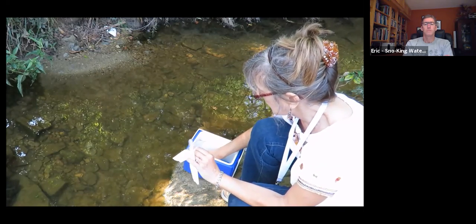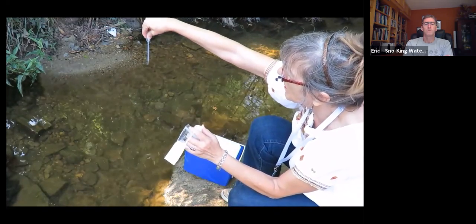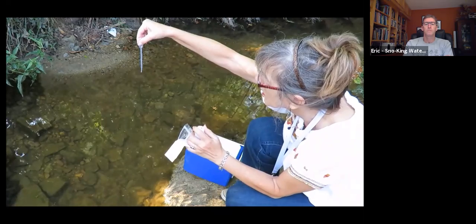Repeat these steps until all 3 media bottles are inoculated with water from the same spot. Keep in mind that media must be plated within 3 hours of collecting the sample and should remain on ice and out of direct sunlight at all times.